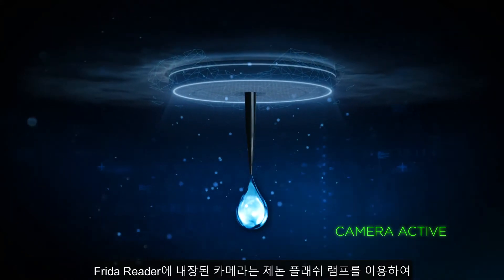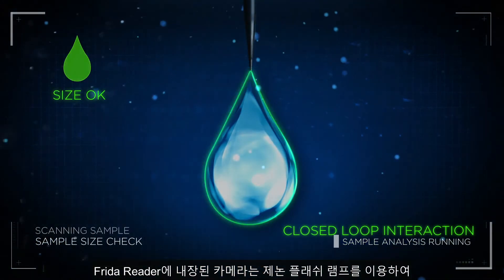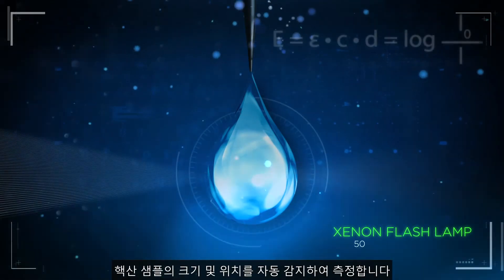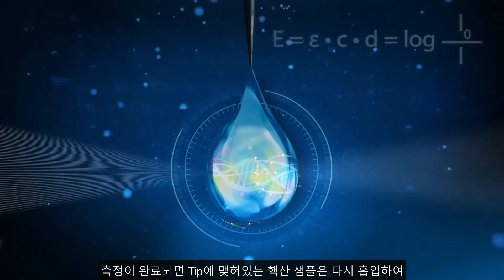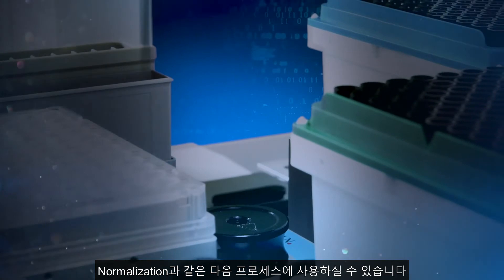To achieve highly accurate results, an integrated camera helps automatically control both the size of the drop and the physical location, ensuring ideal positioning in the optical path before measurement. The hanging drop is then aspirated back into the tip and can be directly used for steps like normalization.